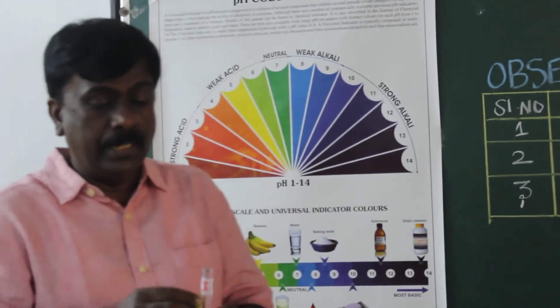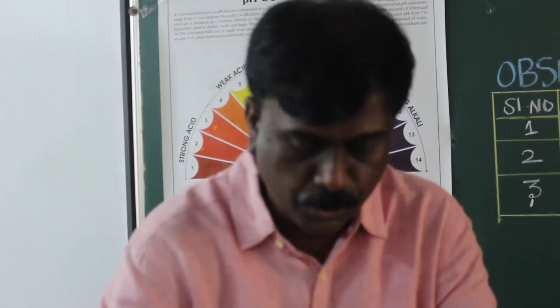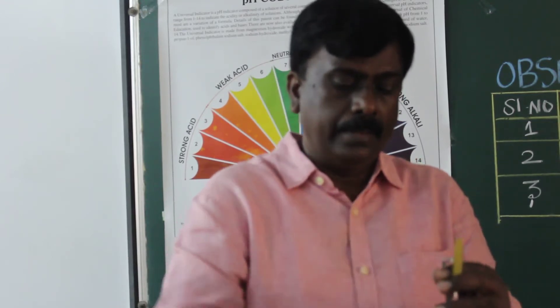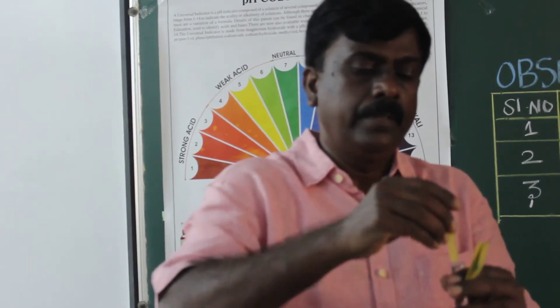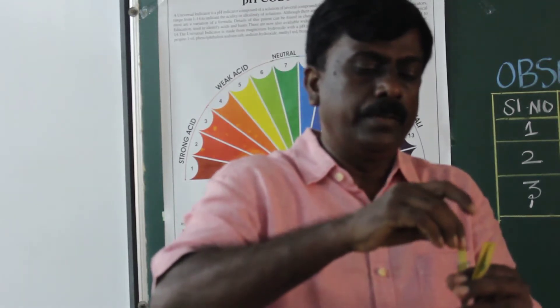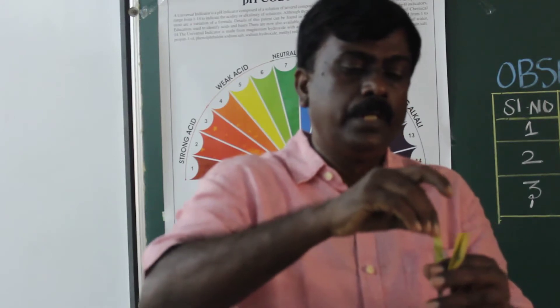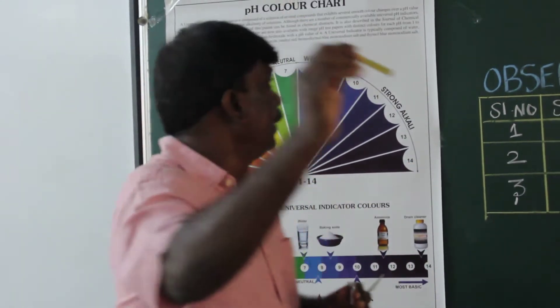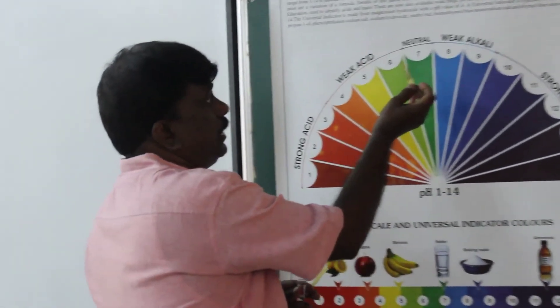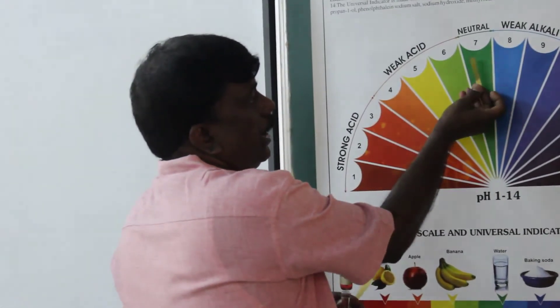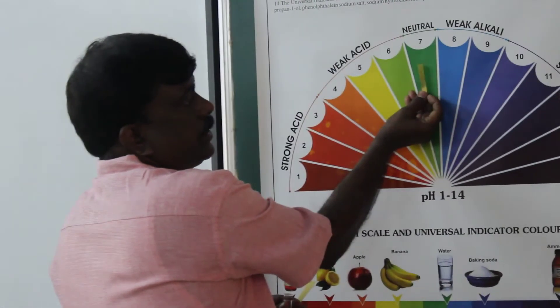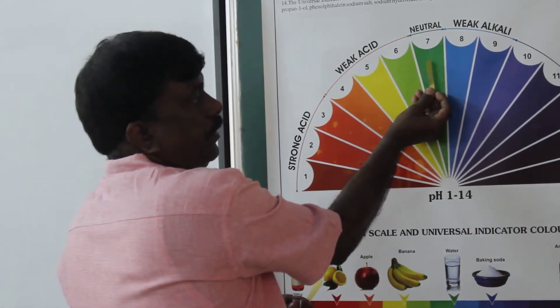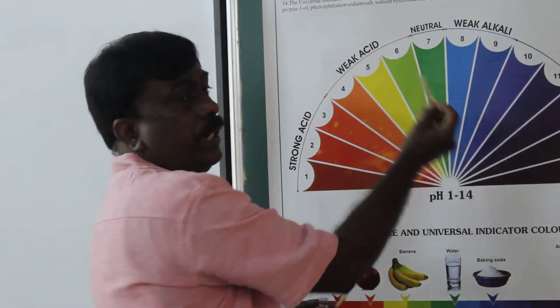Now take the third test tube and dip the pH paper into it. You can see a green color which has to be compared with the chart. The green color matches with pH 7, and thereby we can understand it is neutral.